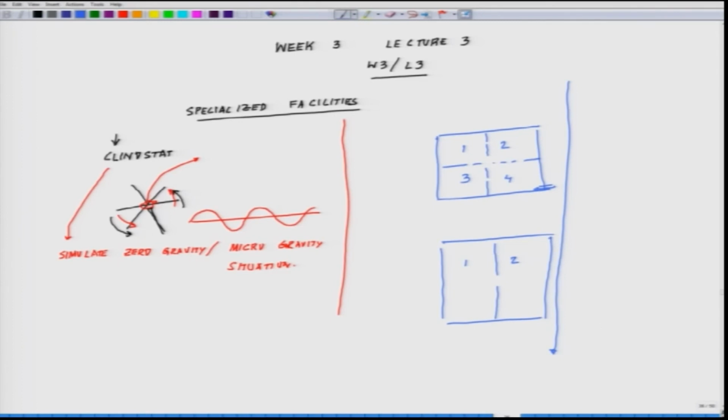And what are the points you have to keep in mind? Again rehashing it, what is the number of users? This is very important. Second, what are their different areas of interest? That will decide what all resources you will be needing, right?